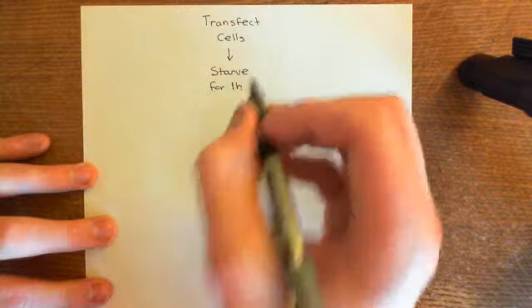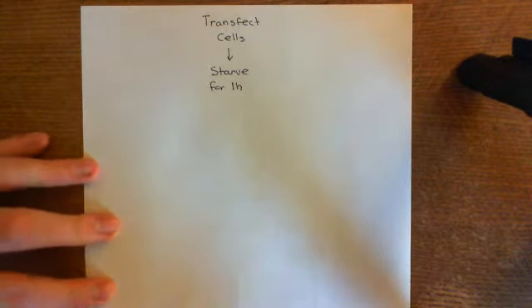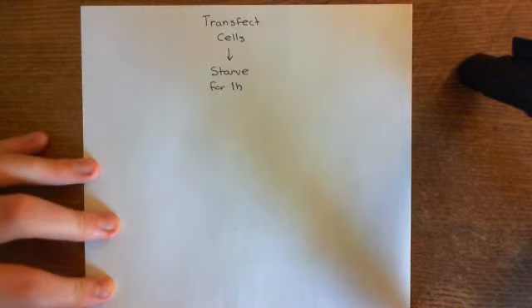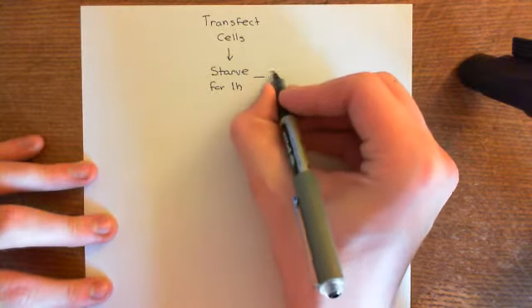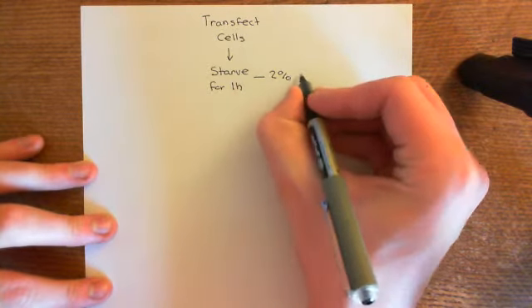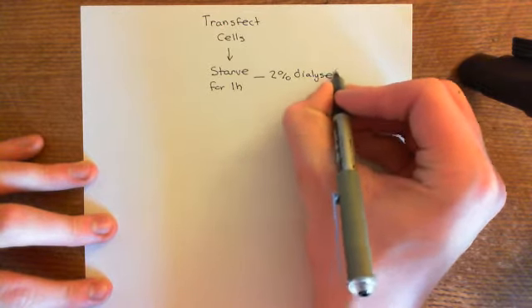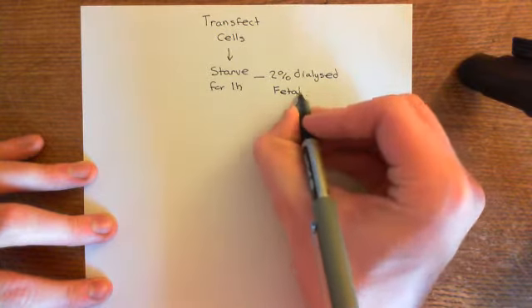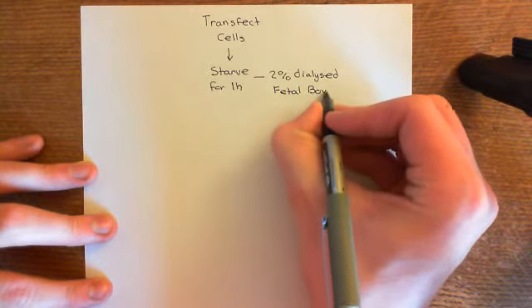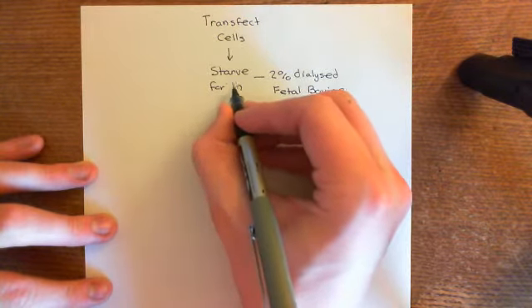Basically you starve the cells in a medium that contains 2% dialyzed fetal bovine serum.